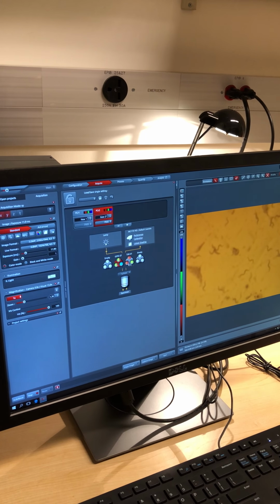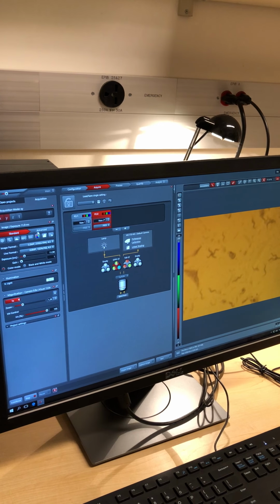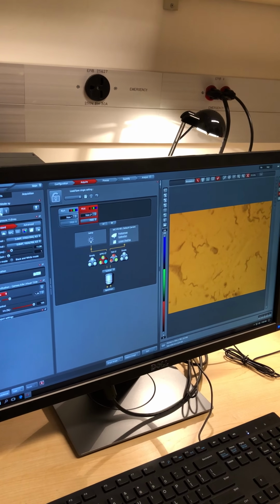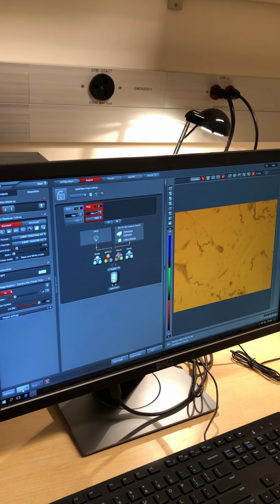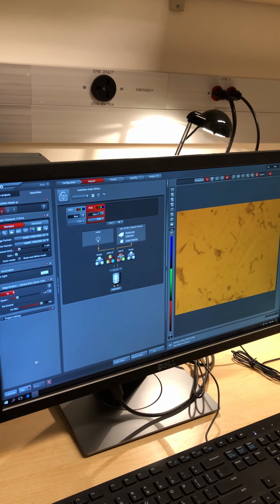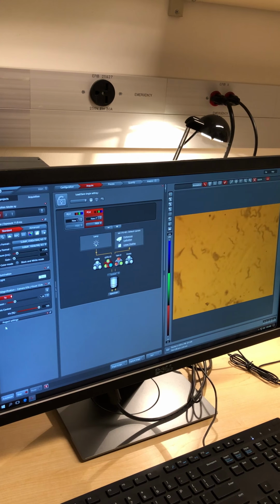Is that in focus in your eyepiece? Yes. And I can show you that it can be better. Oh, there you go. That's better, but she's doing that manually. Sorry, I stopped live. I think there are some settings for this autofocus where you define how far it's going to go, so we'll mess around with that.